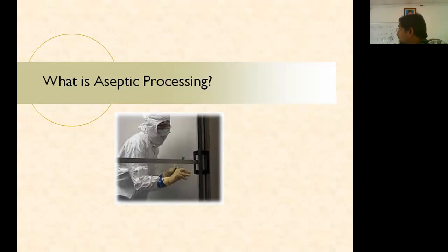So you can see clearly how he is handling it with that clear picture. It's showing the way he is dressed, right? So in aseptic processing we maintain basically three different things. We maintain the material entering the room, we maintain the person entering the room, and we maintain the quality of the air entering the room. Everything entering this room should be free from particulate matter, dust, bacteria, pathogens, and everything. So we should carefully monitor.